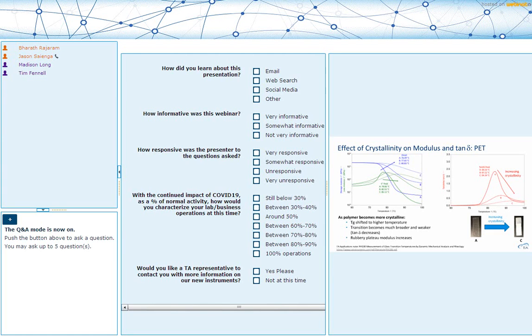Specifically, it should not be used if any crystallinity is present, or if the actual structure is changing with temperature. For example, let's say you're going through a temperature range and you start to have a cross-link reaction. TTS would not be advisable in those conditions. TTS does not work if you're working with block copolymers. It can work maybe within a limited temperature range, but more often than not, you need more complicated types of analysis. And then it works on simple materials.